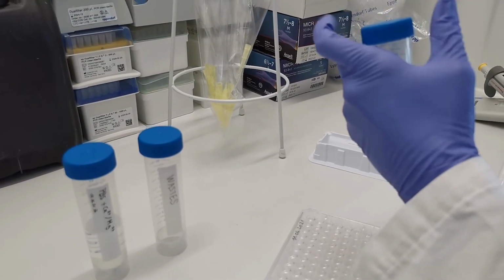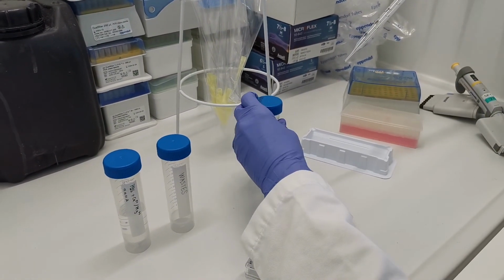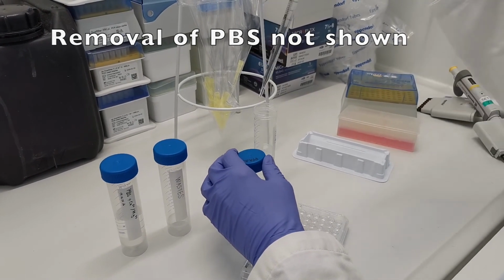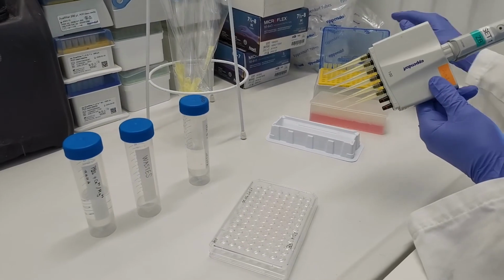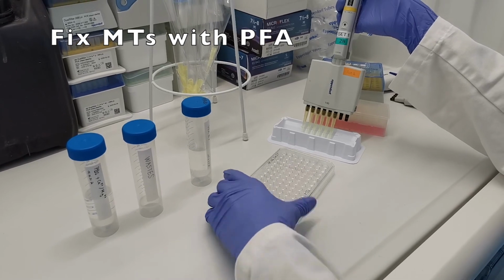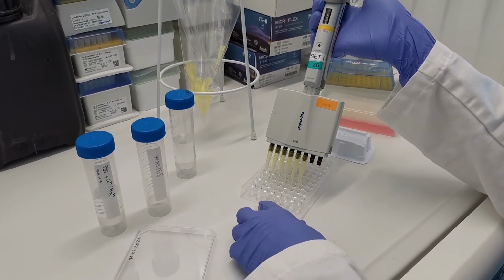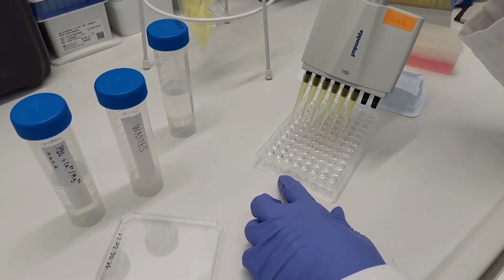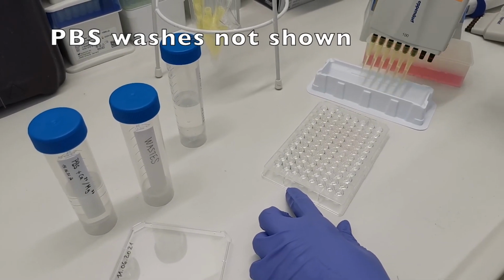Following this, 150 microliters of the medium/PBS mixture are removed, and the microtissues are fixed with 50 microliters of 8% PFA. As 50 microliters of PBS is left in the well, the addition of this 8% PFA will result in a final concentration of 4% PFA. Following the 1 hour fixation period, PFA is progressively removed and replaced with PBS with multiple washes.